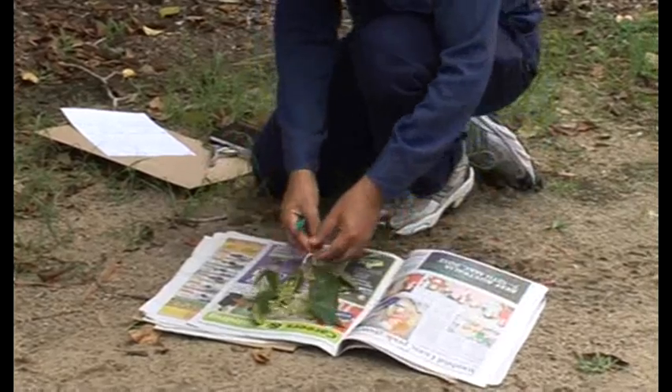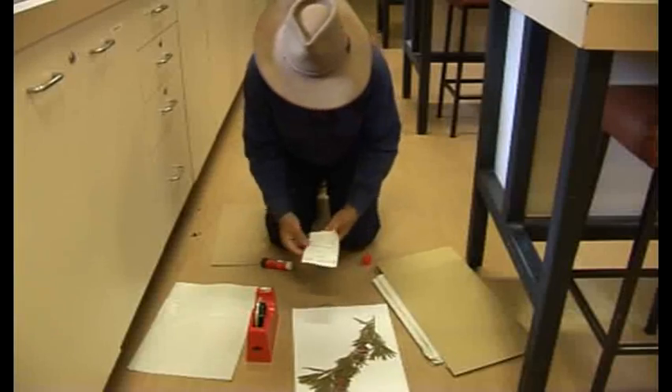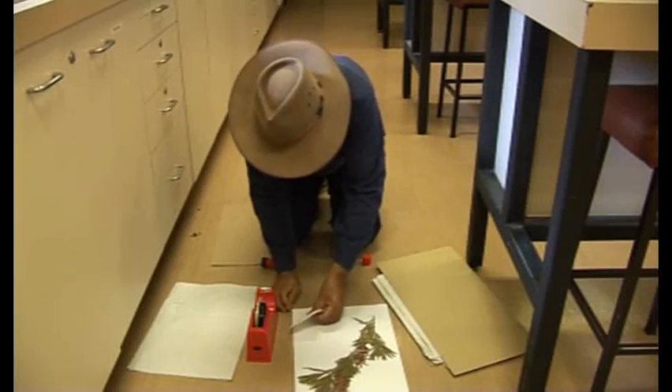Now we have collected the sample, dried that specimen, curated it, and we have mounted the sample.